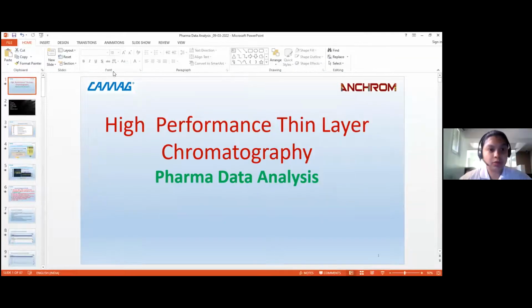So this is about today's topic. Today's topic is majorly about HPTLC and how HPTLC can handle pharma applications.